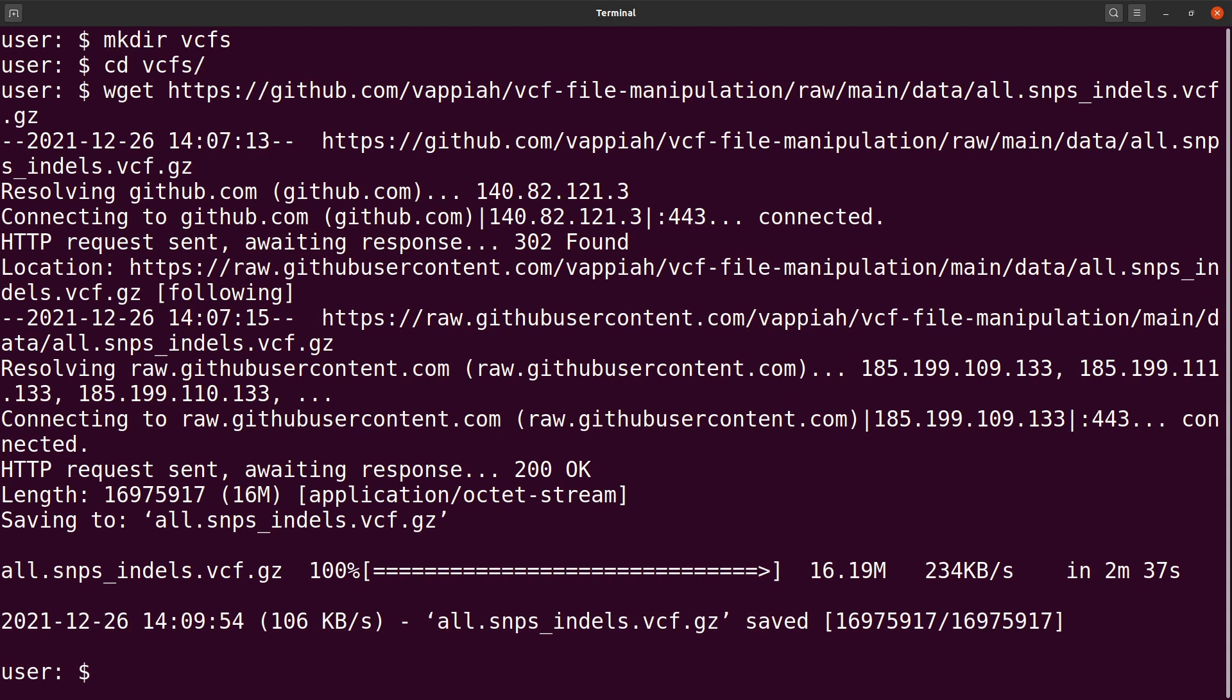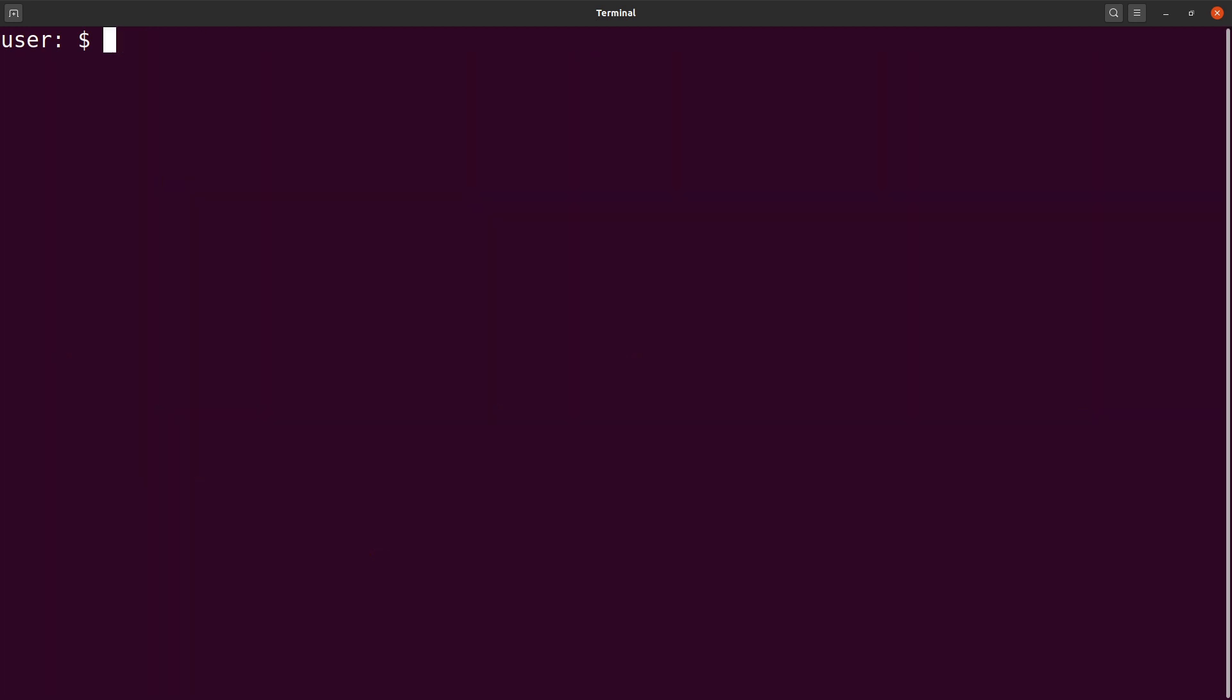Now the data has been downloaded. Let's first clear the screen and continue. Let's do an ls first to check the file. There it is. Now let's start the indexing.